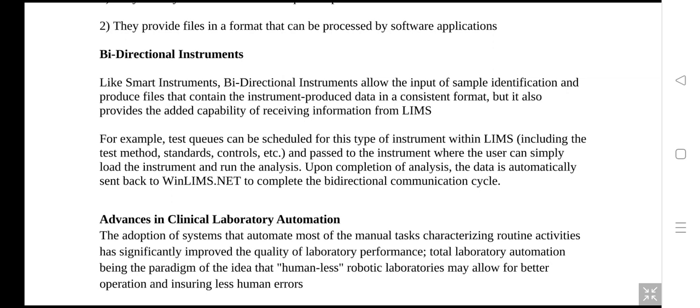So if by any accident or mistake your smart equipment submits a result which is out of this range, it is flagged, and there could be feedback to that kind of equipment. So there's a feedback mechanism.